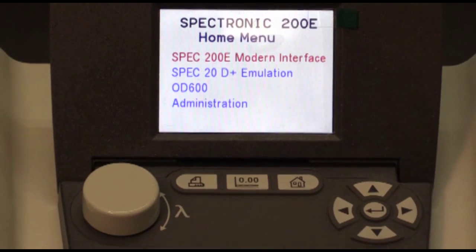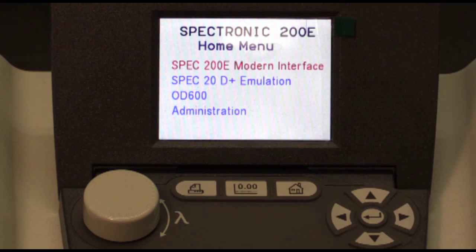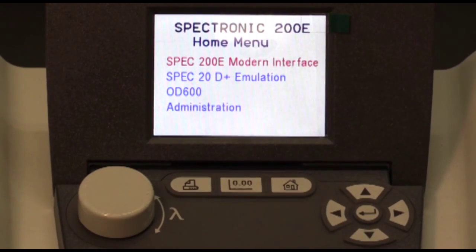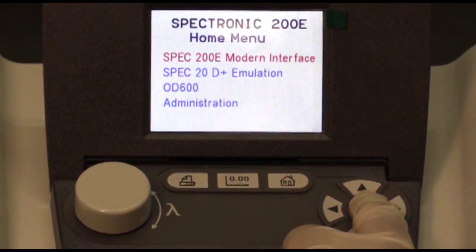At this point, this is where you can adjust the wavelength of the instrument to analyze the sample of interest. To adjust the wavelength, make sure the first option is highlighted in red, and then to open it, hit the enter button.